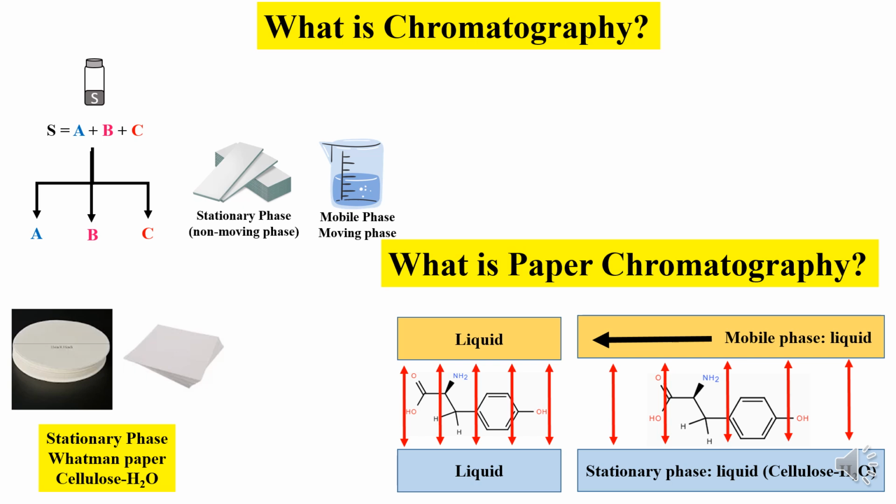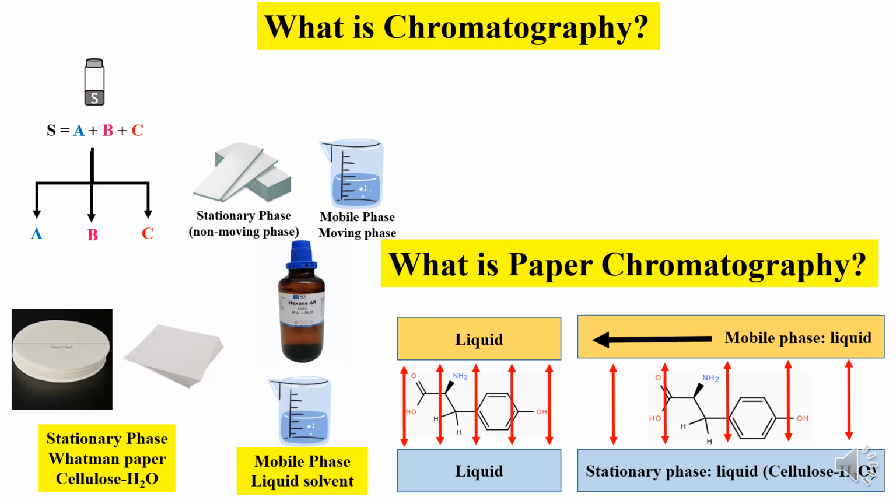Now Whatman paper is available in different shapes and sizes. Mobile phase, which is a moving phase, it is a liquid solvent of varying polarity.